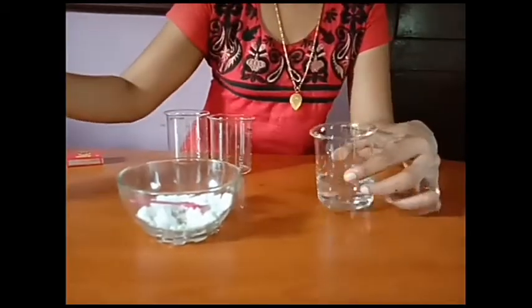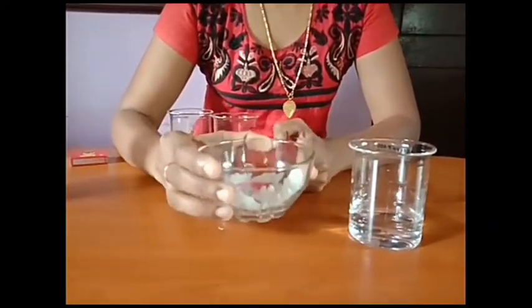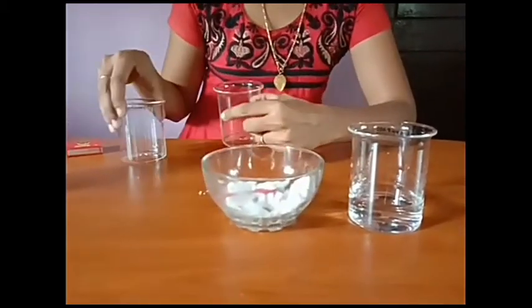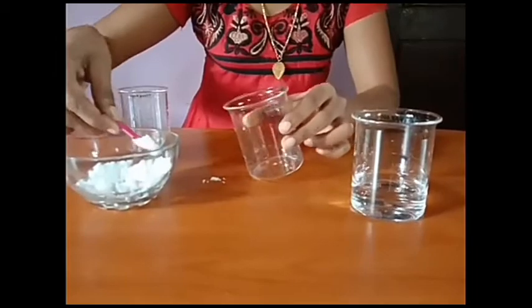For this experiment, I am taking acetic acid, that is vinegar, and baking soda, that is sodium hydrogen carbonate. Take a small amount of sodium hydrogen carbonate or baking soda into a beaker.